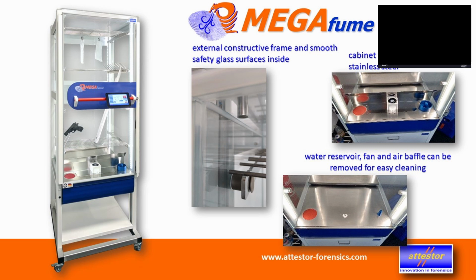So they have this, I don't know whether you can see that, this bolt here, this is actually outside the chamber. So from the top there is a bolt hanging down, and we then mount a glass screen on the bottom of that bolt. And between the glass screens, all we have is silicone seals, very easy to clean. So that was one feature where we said that's brilliant.